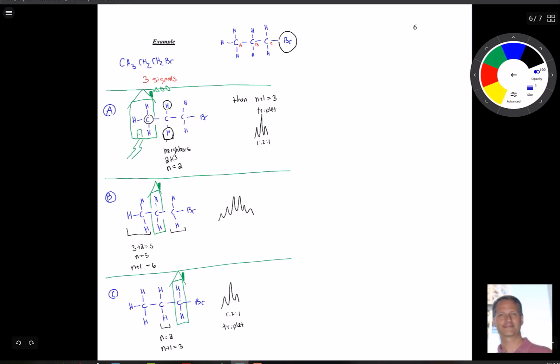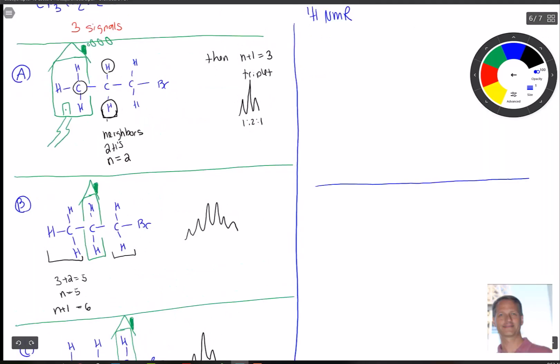So when we put our spectrum together, let's draw a little line right here, and let's take a look at the proton NMR spectrum. So when we do that, we're going to have a straight line across right here, and let's zoom in a little bit here. Okay, and remember that we have a couple parts of this. So if you recall, right around 0, that's our tetramethylsilane. There could be other solvents that are used, but sometimes you'll see a peak there, and this is your chemical shift.